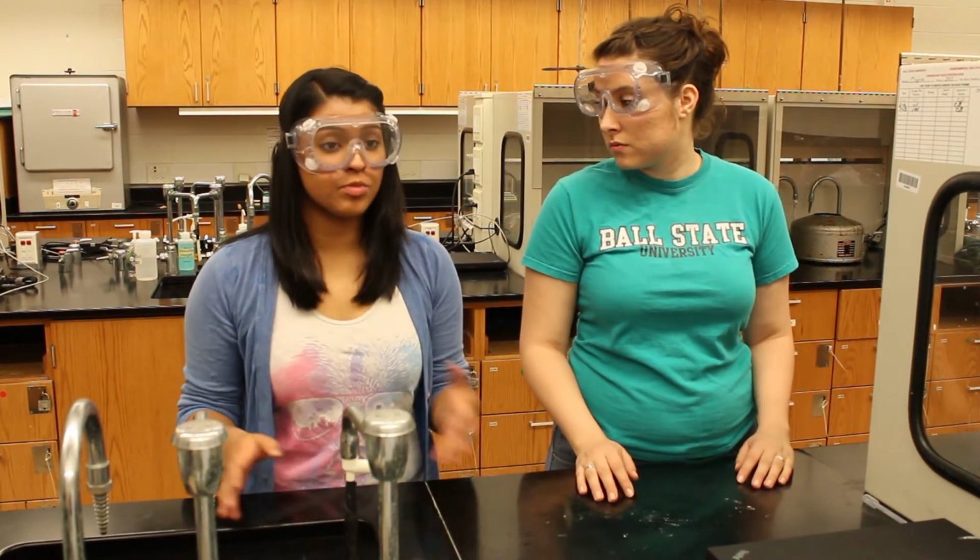And remember that water always flows to the higher solute concentration. So the potato that gained the most mass gained the most water. And if your potato lost mass, it lost water. Once you're done, you can throw away the potato pieces and dispose of the solutions that are in the beaker into the sink.